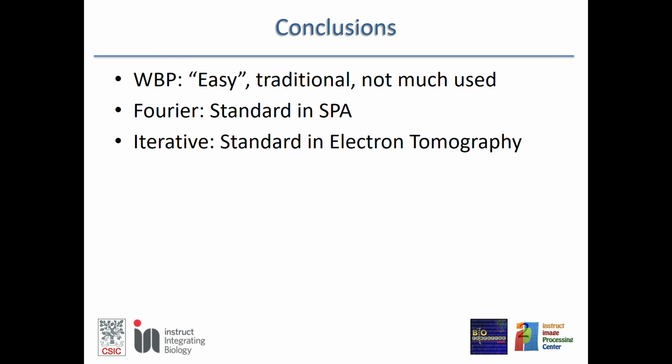And iterative algorithms are the standard in electron tomography, and they also allow for incorporating many different priors, like membership of a convex set, some a priori constraints like non-negativity or symmetry or being defined within a mask.